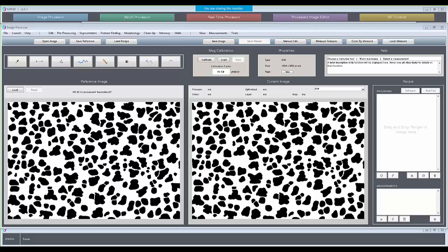It would be something that you would need to plot out from your, say, plot the image to image area fraction or whatever it is that you're after, and use those kind of plotting tools to visualize any variations from image to image. But we do see a need for more data analytics inside of MIPAR, not just histogram plotting, but also that kind of pattern recognition and visualization. So thanks for bringing that up, Tony.